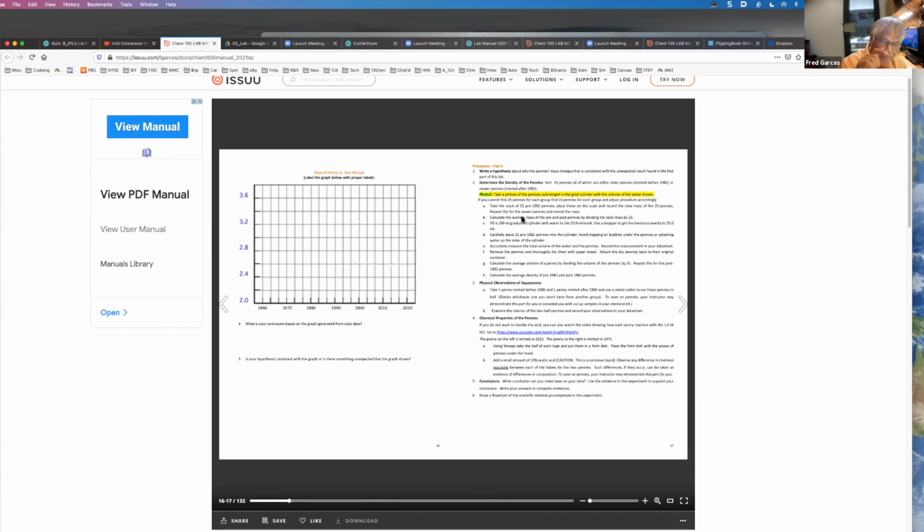Then you take a 100 ml graduated cylinder and fill it to the 20 milliliter mark. Okay, and then you slide those 10 pennies or 25 pennies inside the graduated cylinder, and the water level rises, maybe from 20.0 to 25.3. Well, 25.3 minus 20, that volume, 5.3, is the volume of the pennies, because the water will always be displaced based on the volume that is in there. So you have to take the difference, okay?